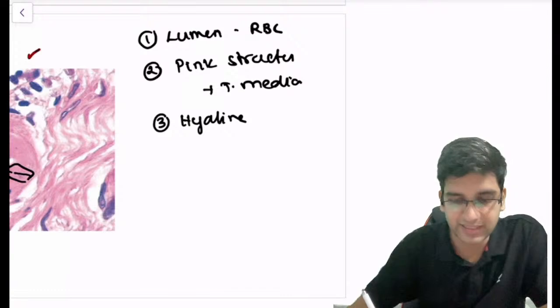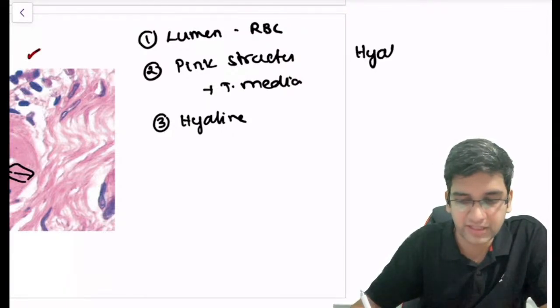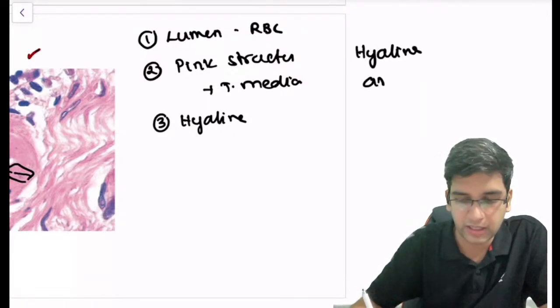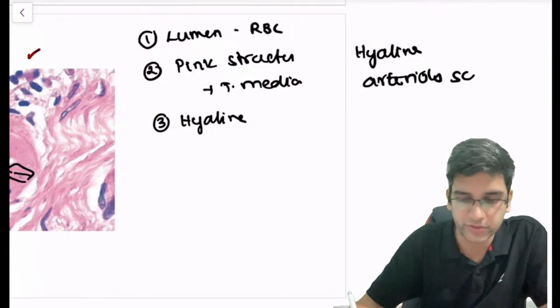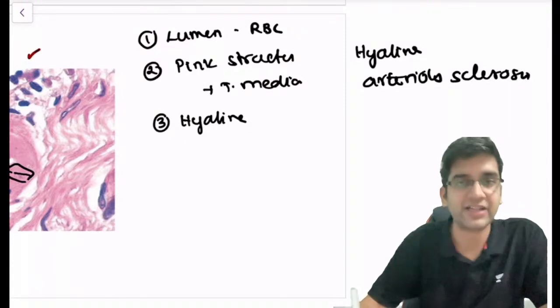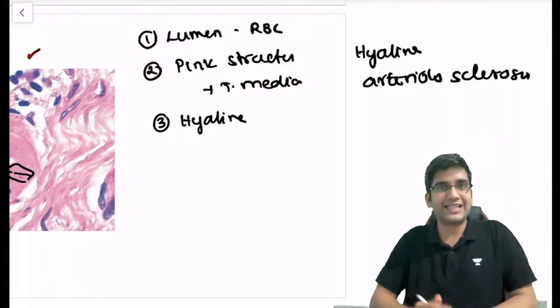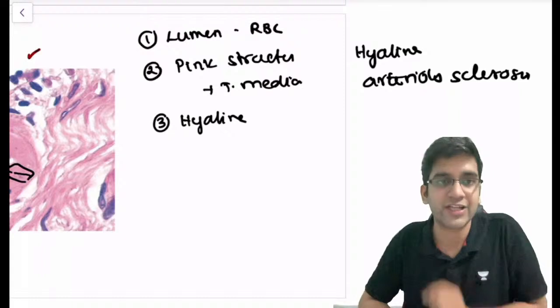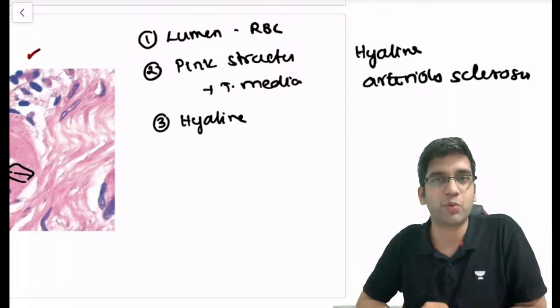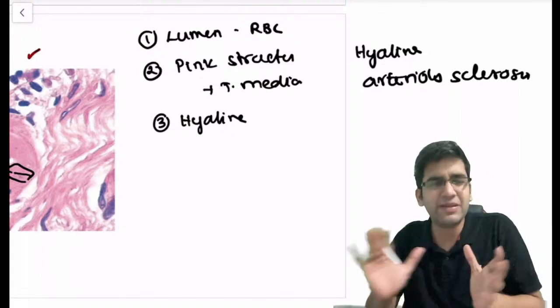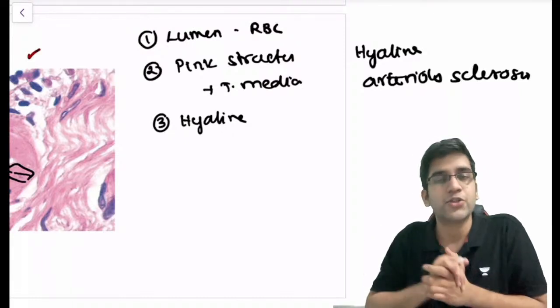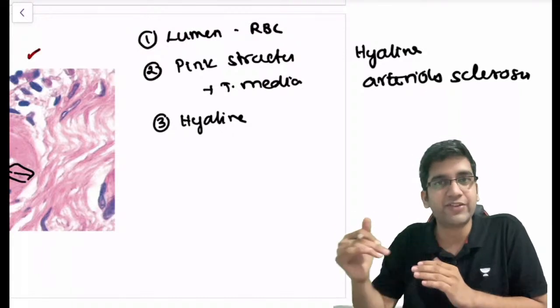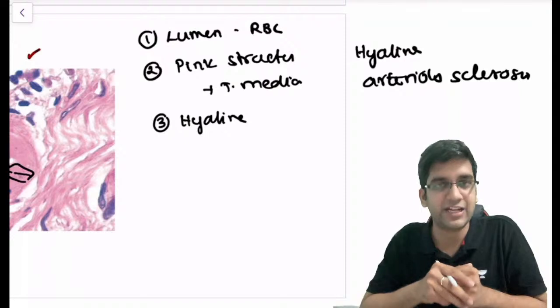Combining everything: I said it's an arteriole, and I'm having a hyaline-like deposition causing sclerosis — so this is a classical case of hyaline arteriolosclerosis. This is a very very important and very basic term.